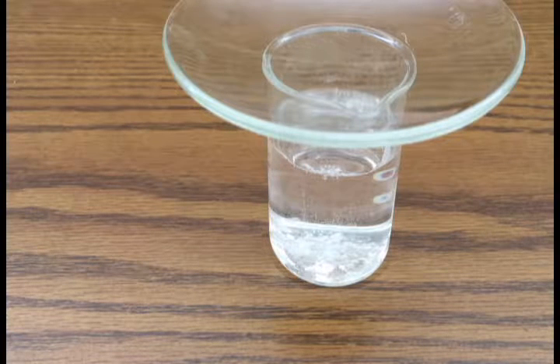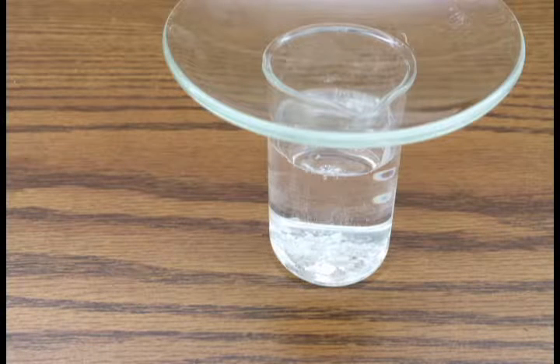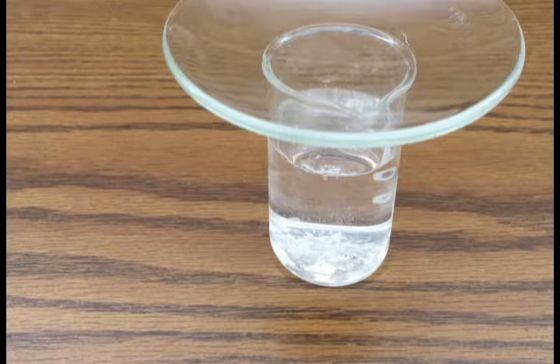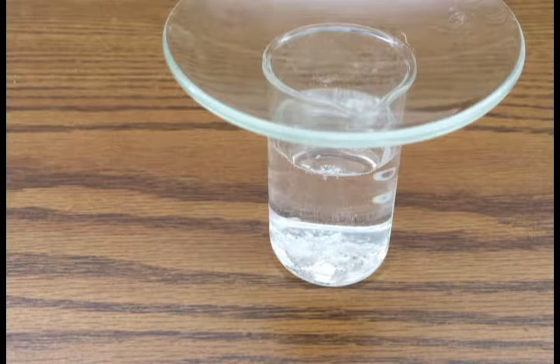The bubbles you are seeing is actually hydrogen gas being given off. The calcium metal is reacting with the water to form calcium hydroxide and hydrogen gas.